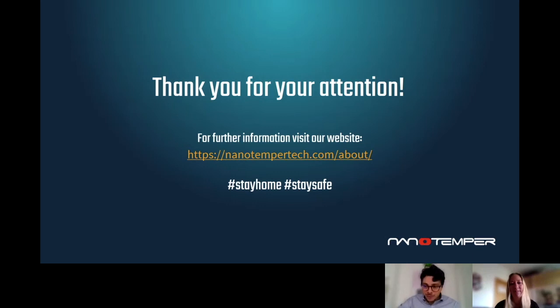Before leaving this webinar and our guest, I have two questions for you. The first is more of a curiosity. You showed us interaction between the host and the viral particle, but often the viral structure is quite complex. We have virus receptors, dimers, trimers. So I was wondering if MicroScale Thermophoresis can also characterize the virus itself, or these dimerization and oligomerization properties. Yes, a good question. You can analyze dimerization, trimerization, and oligomerization very easily using MicroScale Thermophoresis. The only thing you need to do is label your protein, and then use the same protein as a ligand. There you can find out how strongly it interacts with itself. We also have several publications on this topic, which you can consult for more information on how exactly to do this.